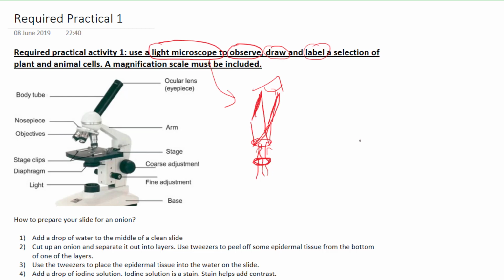Obviously if it's opaque, when you see a cell, it sort of looks like this, and you have, let's say, shaded areas here, which is the nucleus, and there's a cell membrane. You'll see this because these structures here are opaque, okay, so that means that they don't allow light through. But the structures in between are usually translucent, which means they can let some light through, or transparent, which means it allows all light through. And the nucleus itself is semi-translucent, and some are opaque structures in this structure. So light goes through and it comes to the eye. Our eyes then detect it and can actually see it.